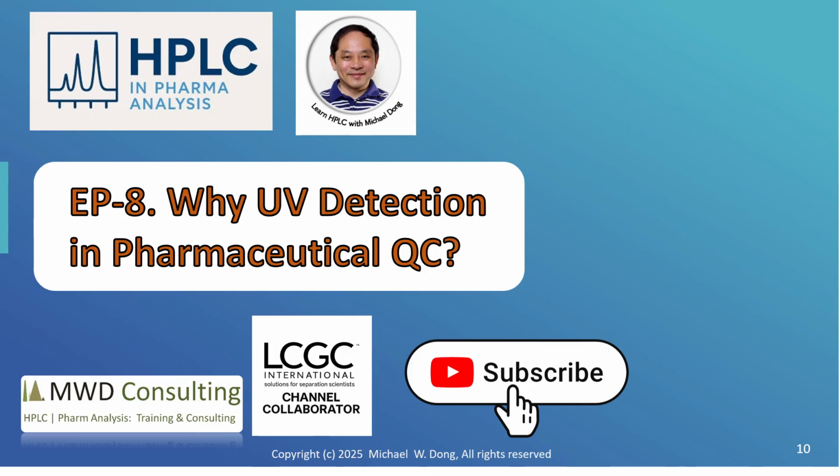In episode number 8, we discussed why UV detection in pharmaceutical analysis QC is required and why mass spec and CAD might not have sufficient precision performance to support quality control.